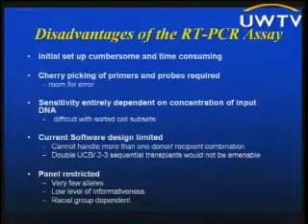So there's plenty of room for error, as you can imagine, especially in a lab the size of ours that handles as much testing as we do in the chimerism area. The sensitivity is entirely dependent on the concentration of input DNA, and this could be really hairy if you're trying to look at sorted cells, where sometimes all we get is 1 or 2 nanograms of DNA.